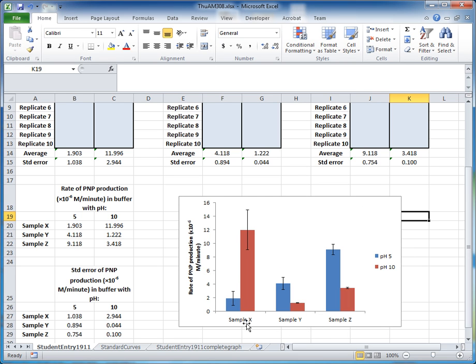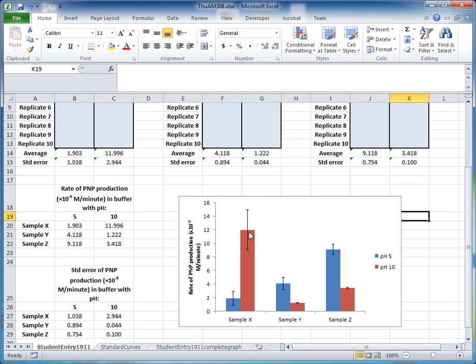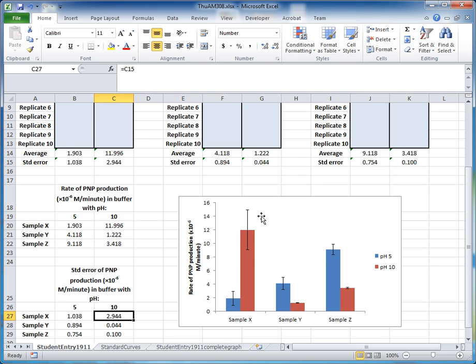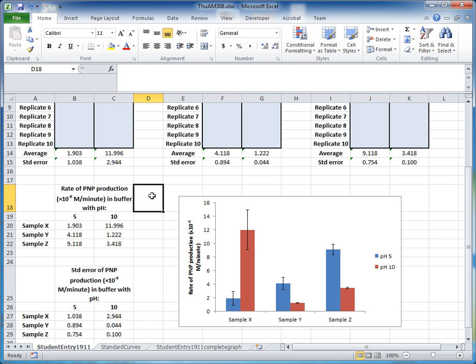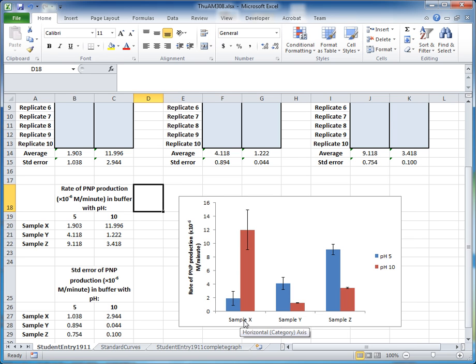The error bars are now visible. For example, for pH 10 Sample X, the error bar represents plus-minus standard error — so the standard error is 2.9 both above and below the column. This is essentially the graph we want to end up with: it shows the rates of PNP production for phosphatase samples X, Y, and Z at the different pH values.